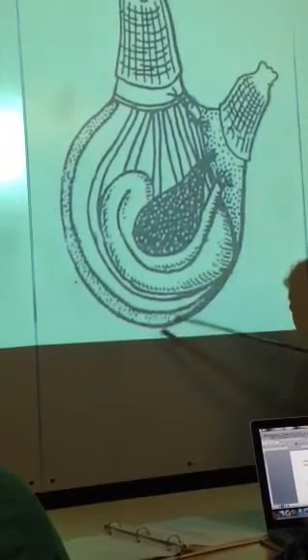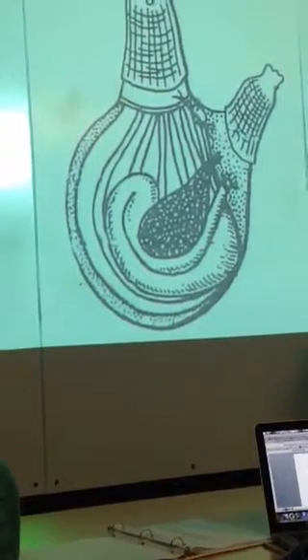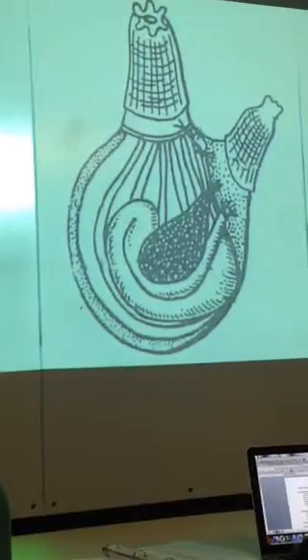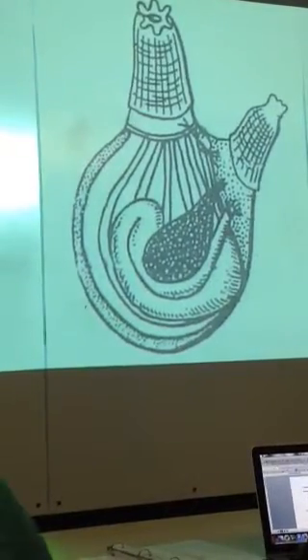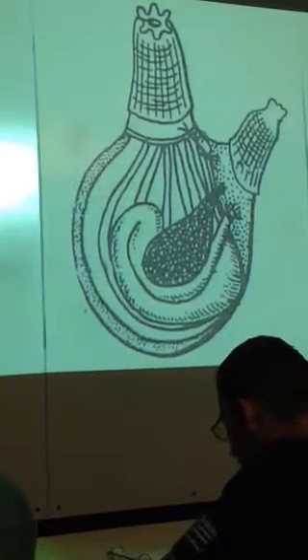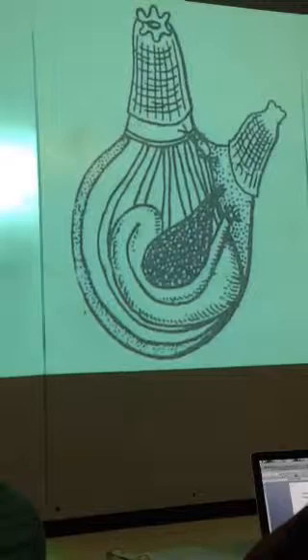I haven't looked at it, but the endostyle is that sticky mucus-covered channel that collects the particles, the food particles, just like the amphioxus has it. In the amphioxus cross sections, you can see an endostyle clearly. It's right at the very bottom. It's that little U-shaped evagination, if you want to call it that.